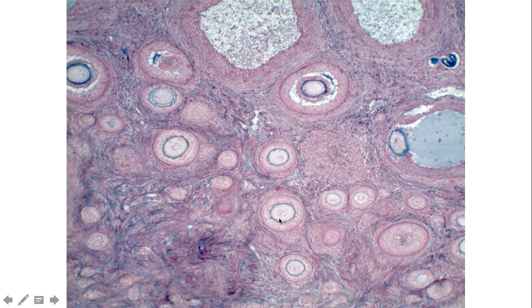For them to become secondary follicles, you're going to want to look for this space, which is referred to as the antrum. Here you can see a little space. This one over here we would also call a secondary follicle because of the presence of this antrum. As this antrum is forming, we will now start to give these cell layers a different name. We have the oocyte in the middle, the blue zona pellucida, and now the granulosa cells directly outside the zona pellucida are referred to as the corona radiata. So the corona radiata refers to this layer of cells directly outside the zona pellucida. Outside that is where the antrum is forming, so the antrum exists outside the corona radiata.